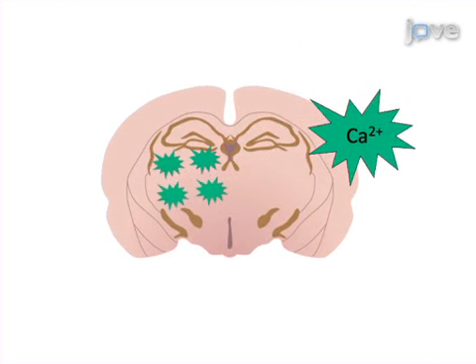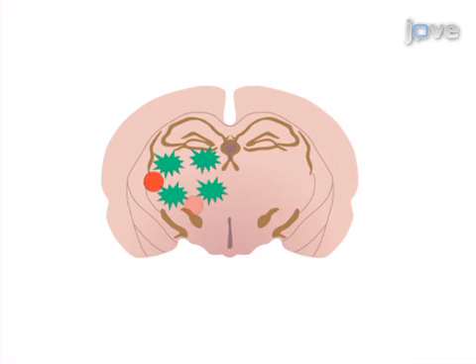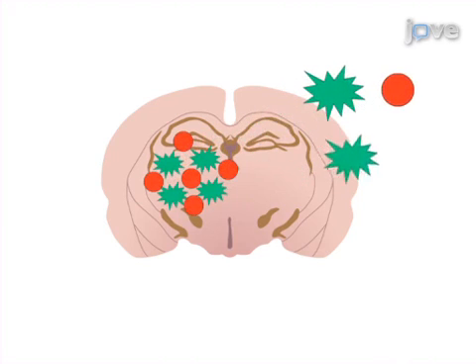Ultimately, immunohistochemistry is used to show that the cyto-GCaMP3 is expressed only in astrocytes but not neurons, and that the virus injection did not cause overt astrocyte reactivity.